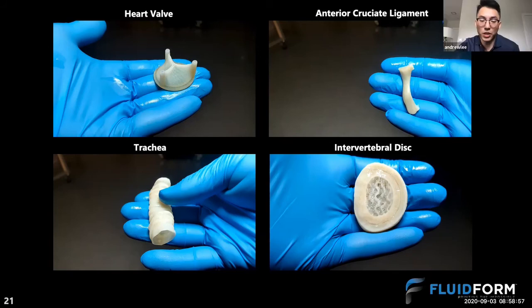Yeah, definitely. We spent a lot of time playing around and developing the support material when we were developing this. And it certainly requires a certain rheology to be able to embed and trap your material. But within that range of rheology, you can print different collagen solutions of different concentrations.